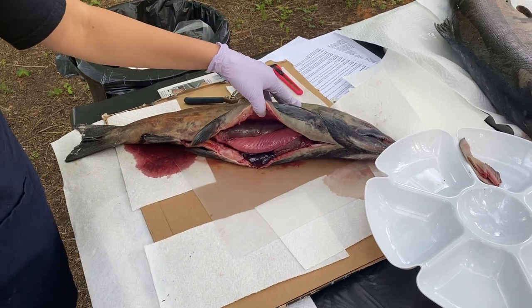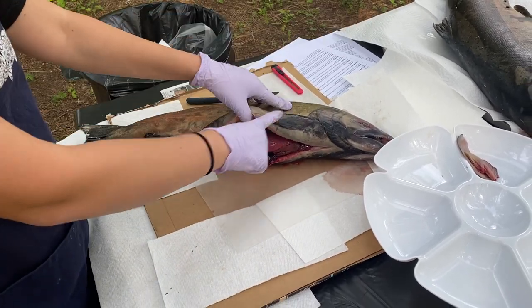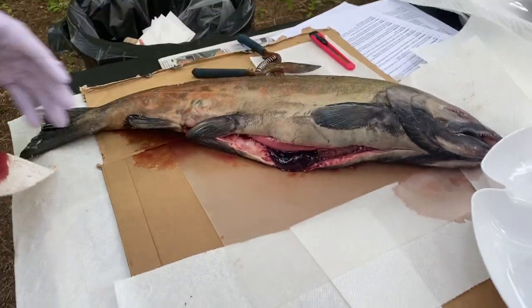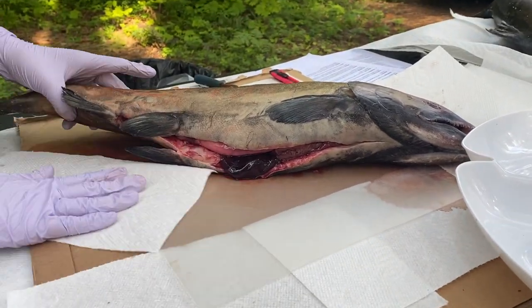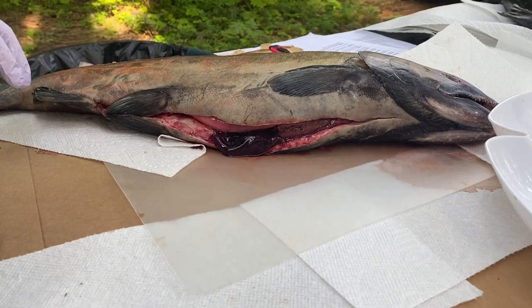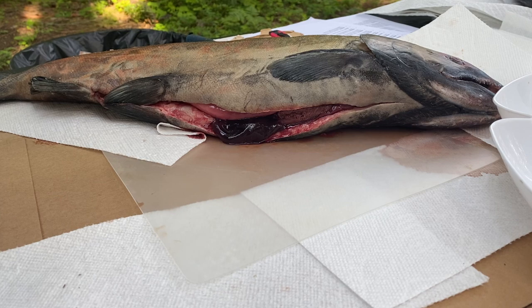So when we see the size difference of these two fish, we might have thought that the big one was going to be the male and the small one was going to be the female. But actually, we can see when we open it up that the smaller one is a male, and we would call this a jack. A jack is an early returner. That means this guy didn't spend as much time in the ocean or the salt water as some of the other really big male adults that came in.